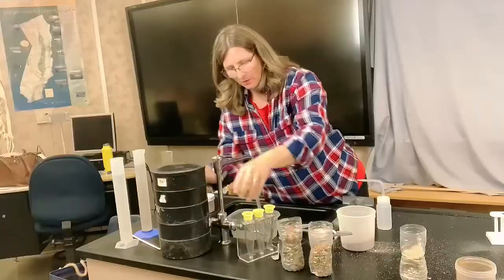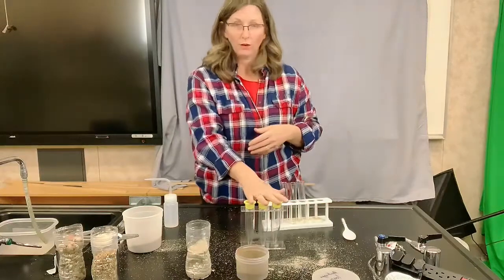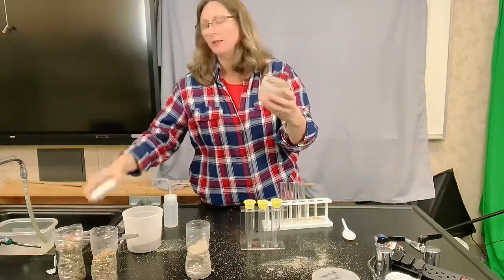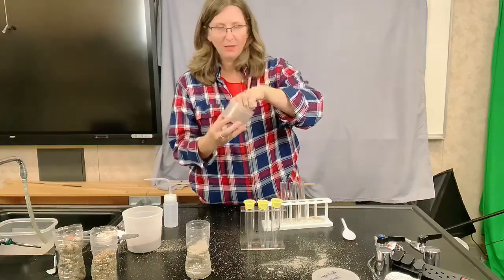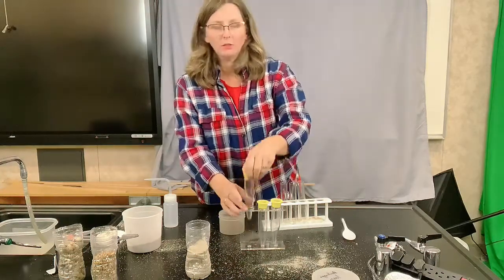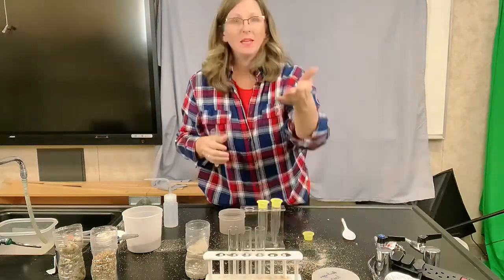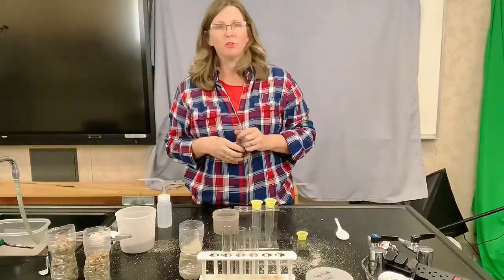All right? So a farmer is going to start to use something more like the settling tubes with water. And they'll take their soil. This is a nice soil. We actually got this soil out at the Santa Margarita Ecological Reserve Overlook Station. So this is a very beautiful California soil. And what you'll do is you take your settling tube. In class, we would use test tubes. In the Nearpod, you're using jars. Anything that you can get a nice straight side on.